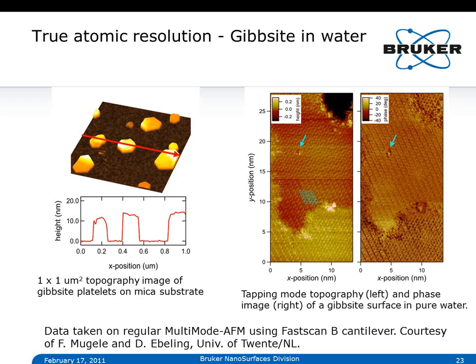What is even more astonishing here is not only do you get the resolved lattice, but when you look carefully, and I indicated that area with the blue arrow here, you can actually see a single molecular defect. That is a clear indication that you get true atomic resolution with an AFM in liquids. And it's with a regular MultiMode that probably 70% of all your listeners are using right now.